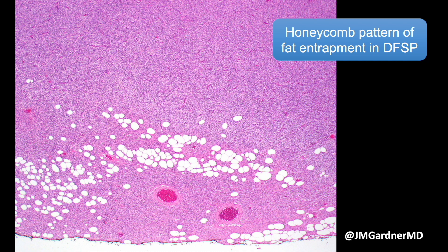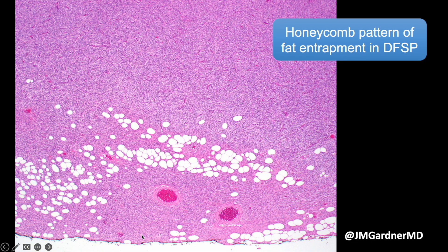Here is the classic honeycomb entrapment. The DFSP invades the fat and eventually replaces most of it, leaving behind only scattered individual adipocytes or tiny crushed islands. There is no fat necrosis at all — it is very clean entrapment of the fat, as opposed to the messier, dirtier entrapment seen in dermatofibromas. Everything in this screen used to be subcutis and has been filled up with DFSP, with only a little fat left behind.